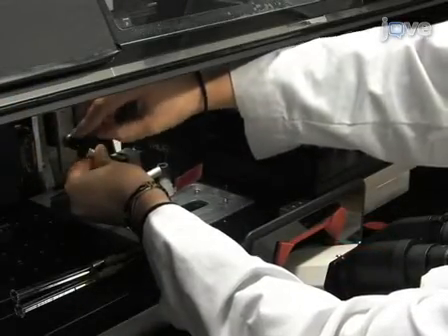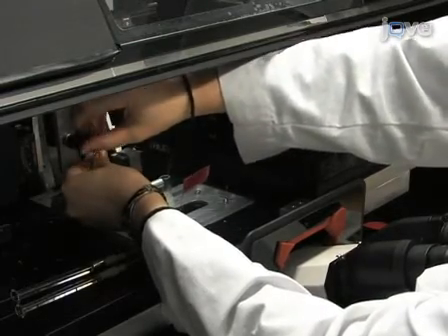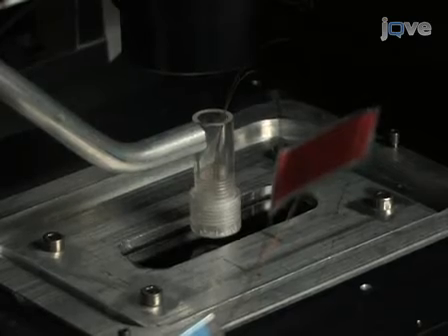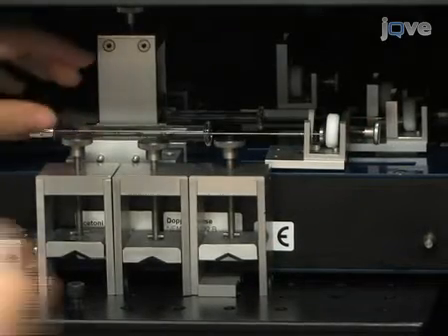To begin setting up the MFP, the probe head is clamped into the probe holder and mounted on the probe station on top of an inverted microscope. The syringes are then placed into high-precision syringe pumps.